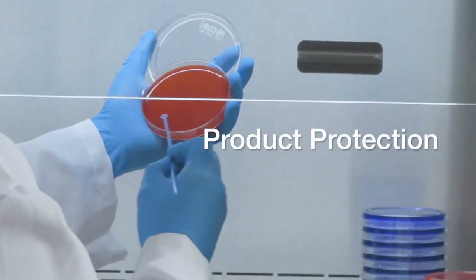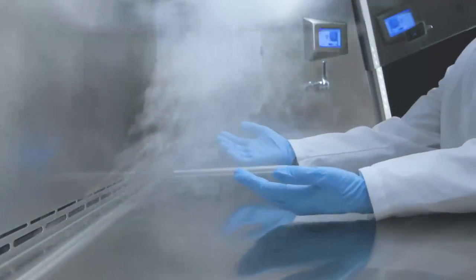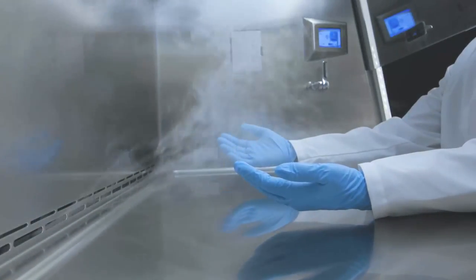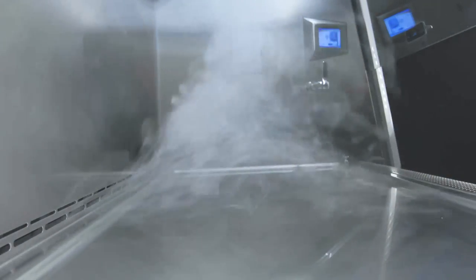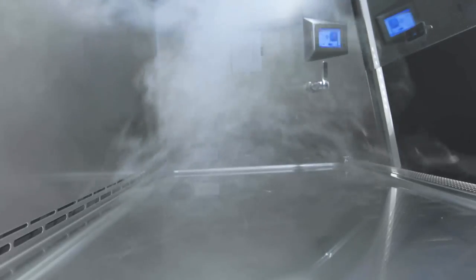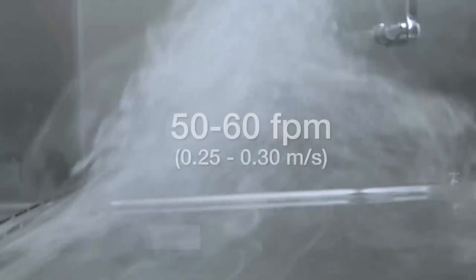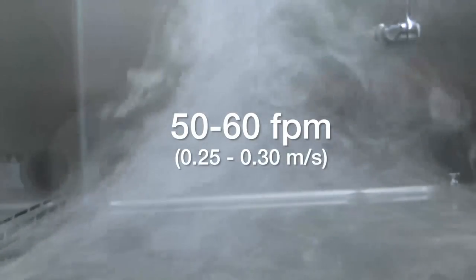A BSC provides product protection by flowing HEPA filtered air downward through the cabinet. Downflow air is laminar or unidirectional and is ISO 5 or better in quality. Downflow air may be of different velocities depending on the model of the cabinet, but is typically between 50 and 60 feet per minute.